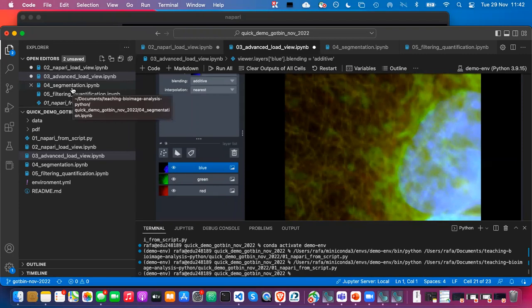So you usually start in an image-based fashion or even a small region of interest, right? Because you want to show that your pipeline is doing what you expect. And once you have it, then you start running it automatically on a batch of images. Usually you want some kind of evaluation mechanism, right? So you run it through, let's say, 20 images, which you can maybe still evaluate by eye. But if not, at some point you need some kind of automated evaluation, so you know that things are roughly working as you expect.